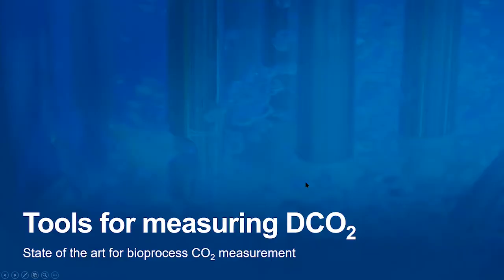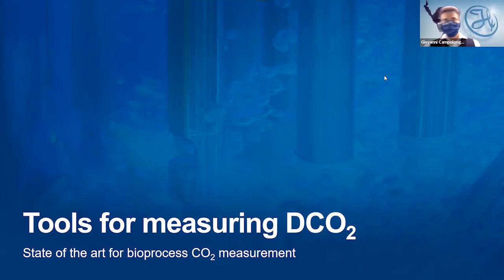So it's clear that the control of dissolved CO2 is a critical factor in optimizing a bioprocess. Giovanni will now discuss the tools that are currently available for this measurement and what's coming in the market. Thank you, Kelsey. I hope that you can see and hear me now. And thank you, Kelsey, again for reminding us why dissolved CO2 is such an important parameter.